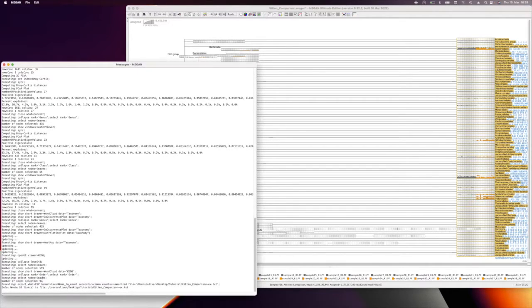So it says export CSV, and then the format, and these are essentially the settings I selected in the small window that we just saw. And then it says where you wanted to write this, and this is the file I saved it in. And then it said I wrote this successfully, and this is the output.